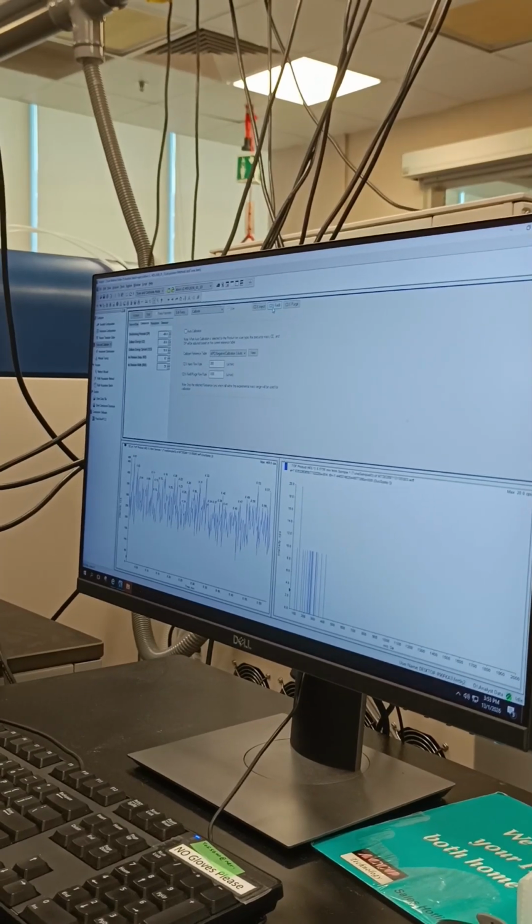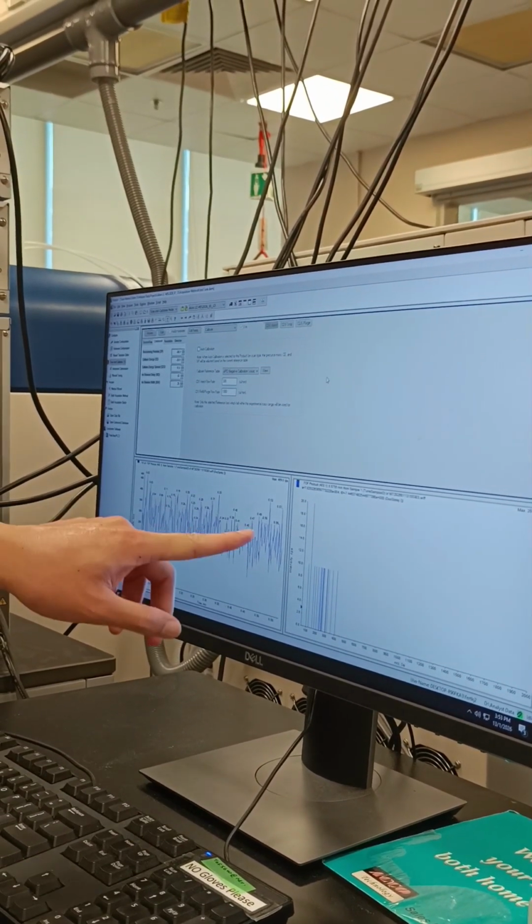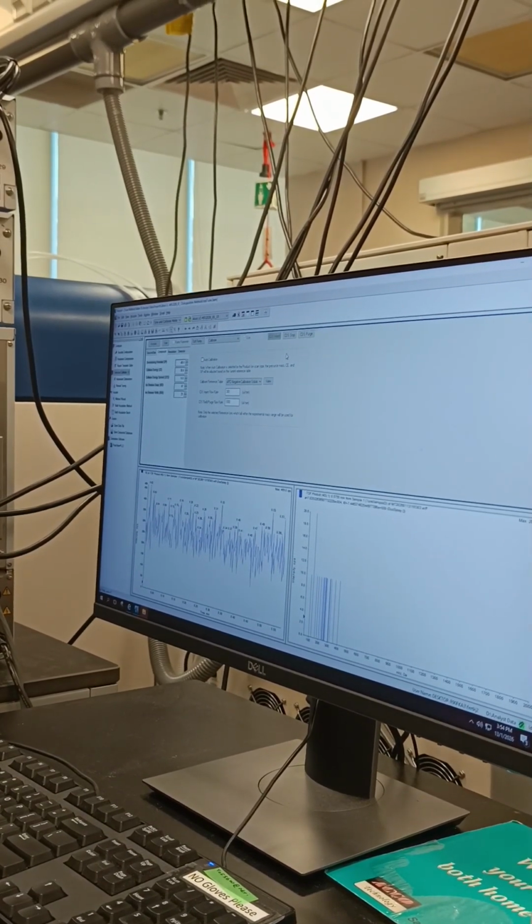So now what we need to do is to CDS refill, because the value here doesn't hit the acceptable range. So this one will be quite fast, 1 to 2 minutes only.